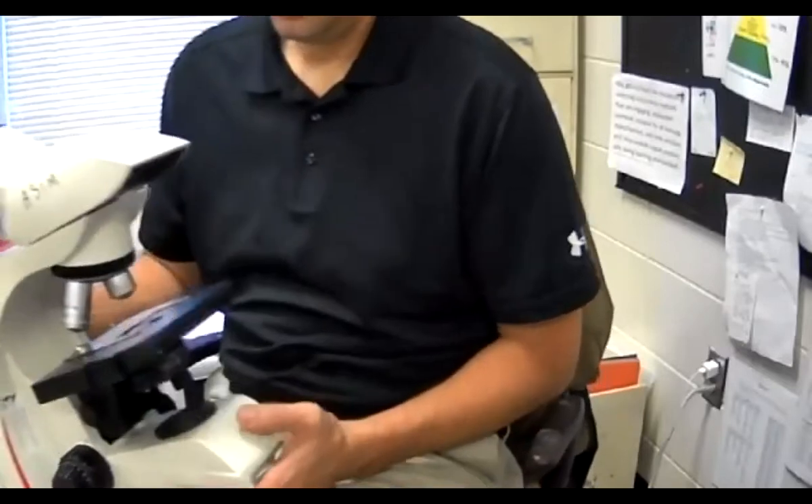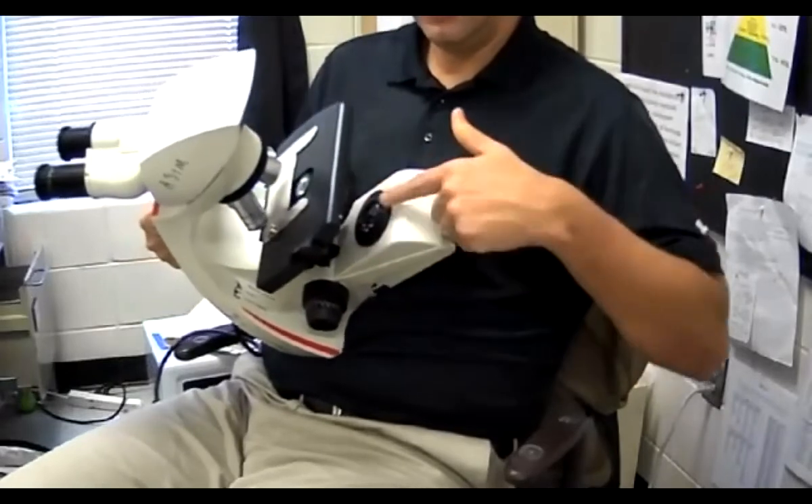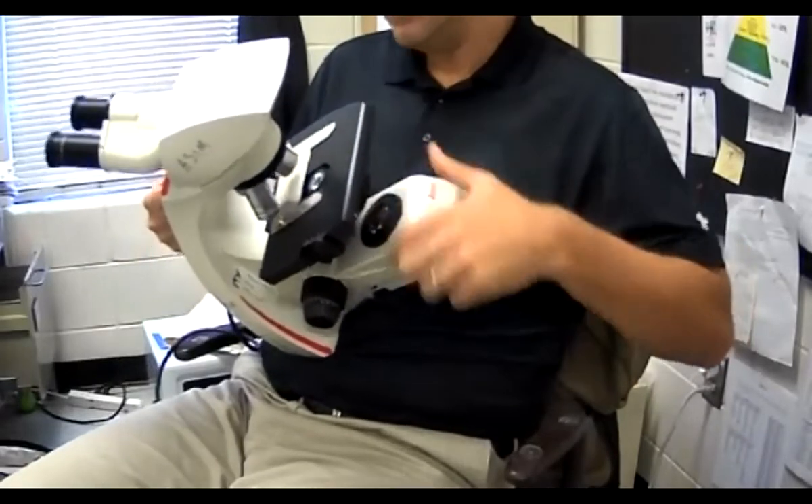The lamp is down here at the bottom right here. This is the lamp.